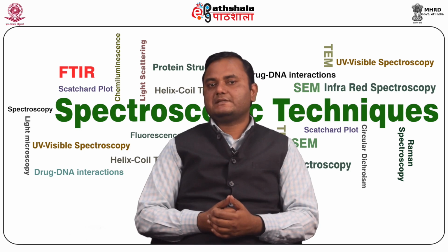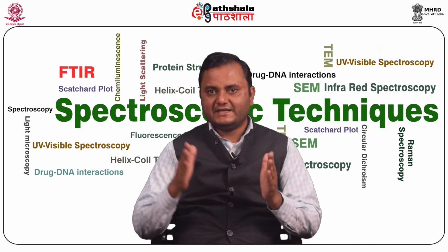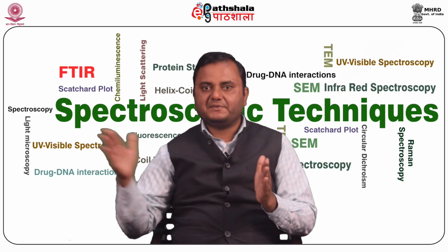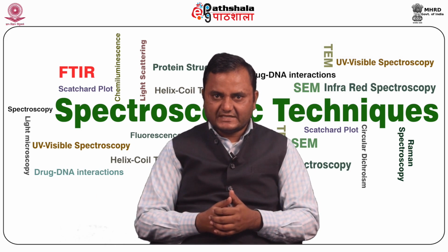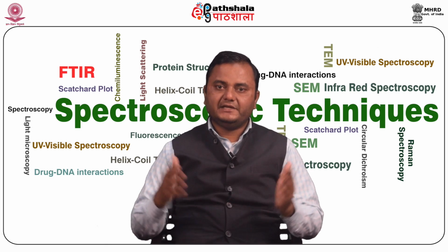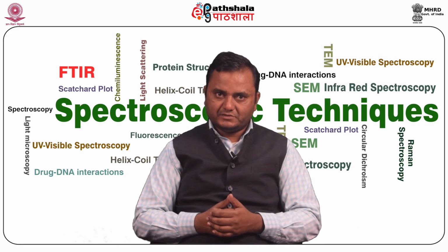Now we discuss some terminology that is mostly used in FTIR, like the resolution. The common definition is the separation of various spectral wavelengths, usually defined in terms of wave number. So it gives you the idea of how the peaks are separated from each other. A setting of 4 to 8 per centimeter is sufficient for most solid and liquid samples. In a gas analysis experiment, you may need a resolution of 2 per centimeter or higher. The higher the resolution, the lower the signal to noise ratio of the experiment.